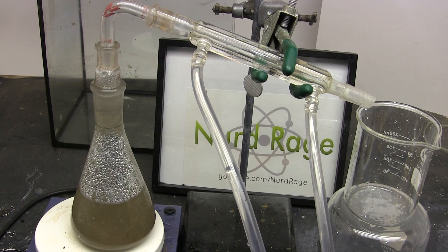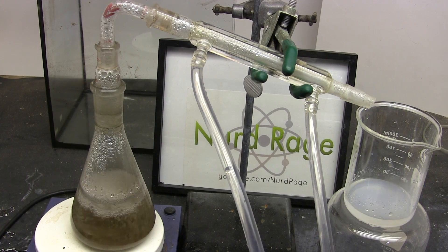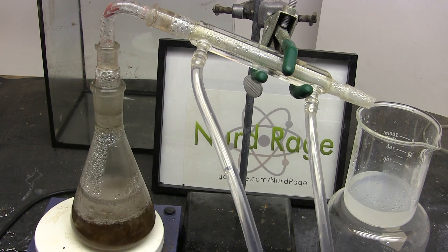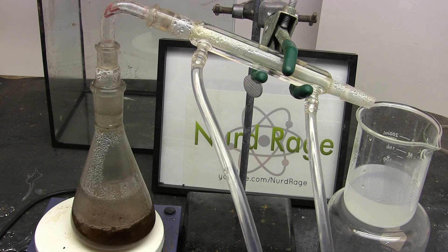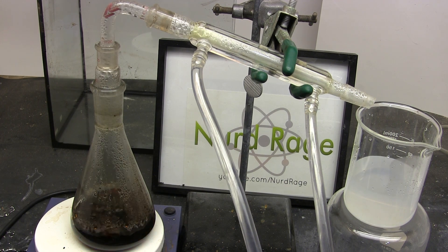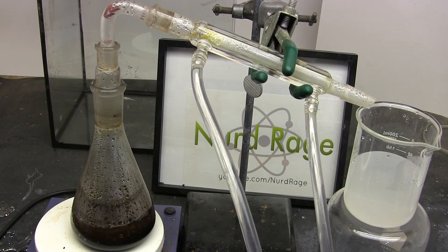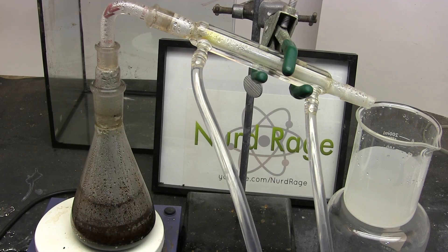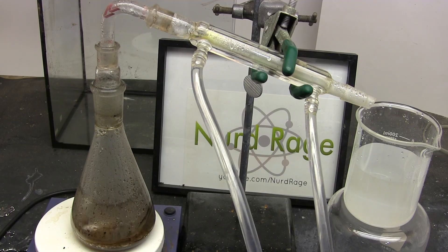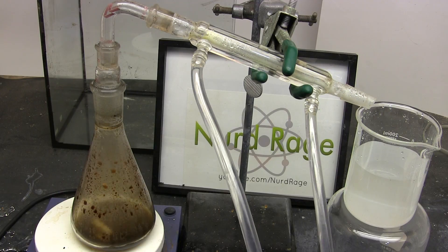It is here we are recovering the hydrobromic acid catalyst for reuse. The solution is cloudy due to small amounts of sulfur being carried over with the distillation. If you're reusing the hydrobromic acid to make more sulfuric acid then this isn't a problem. But if you really want to get rid of it just let the acid sit for a few days and the sulfur will settle to the bottom.